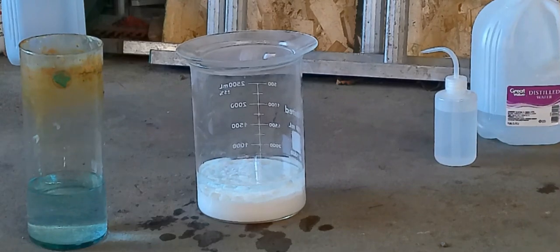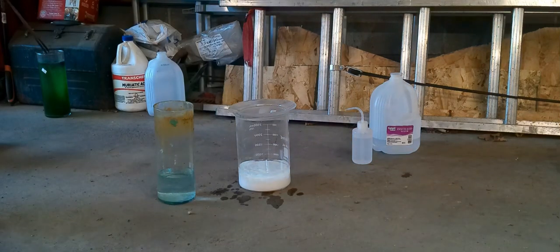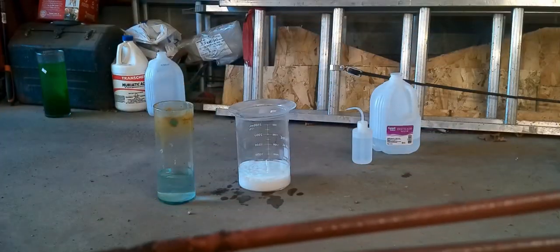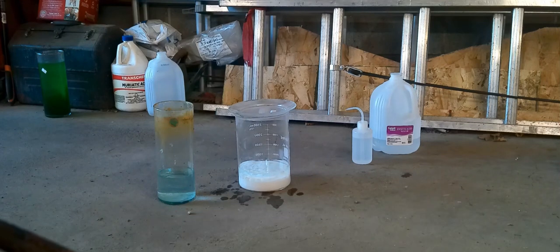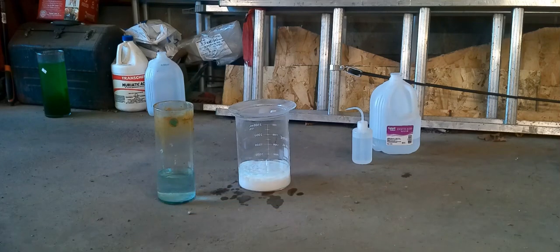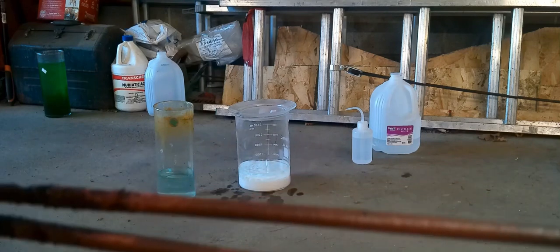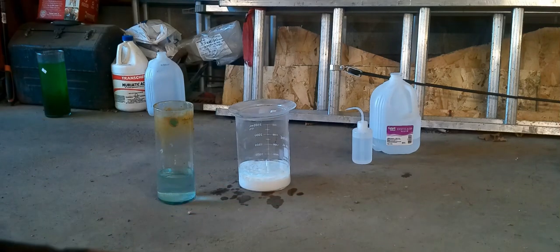I also want to show you these steel rods. When I first showed them to the camera, they were steel-colored, of course. And you can already see that copper color coming in — there is copper coming out of that solution and steel is going into the solution. So I'll be able to get some pure copper from that waste solution before I dispose of it.